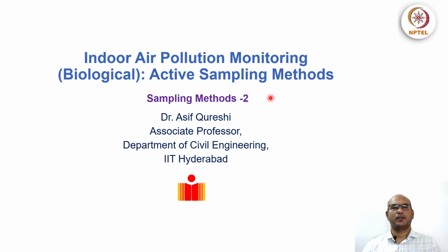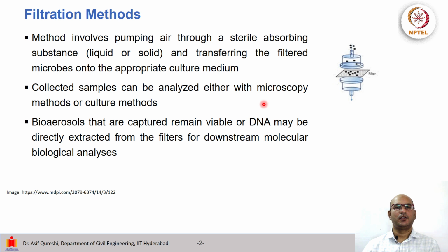Hello. So we will continue our coverage of sampling methods, specifically the active sampling methods. We will review first the filtration methods. These methods involve pumping air through a sterile absorbing substance and transferring the filtered microbes onto the appropriate culture medium.